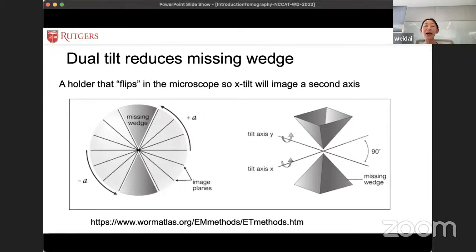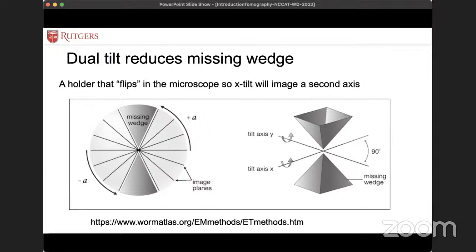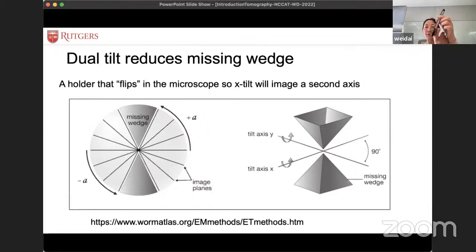Okay, let's talk about ice thickness in the two tilts. Number one, this is my phone. You're tilting this way. The thickness at a certain tilting angle, the electron penetration path will be that thickness. And then double tilt, I mean tilting this way. This is actually a bad example because my cell phone is not a square, so it's not a good way to tell. But if I can draw over here, think about it, draw it on a piece of paper: ice thickness at a fixed tilting angle is actually the same in X tilt and Y tilt.